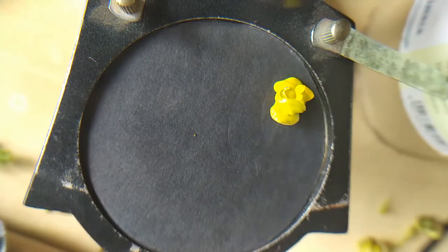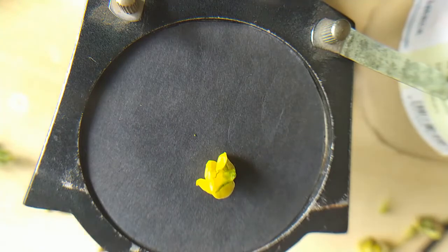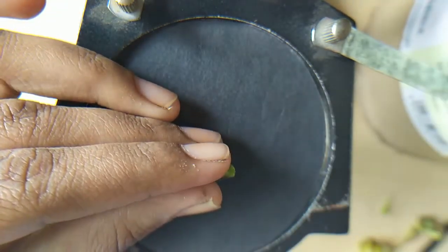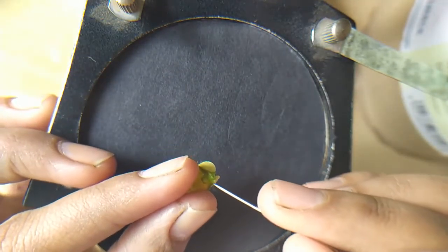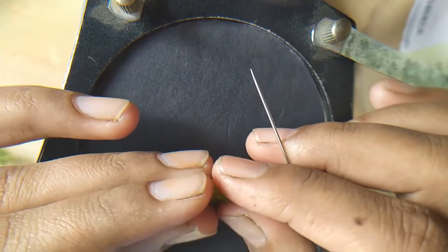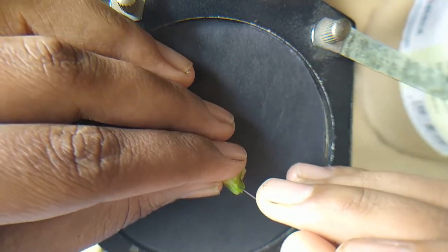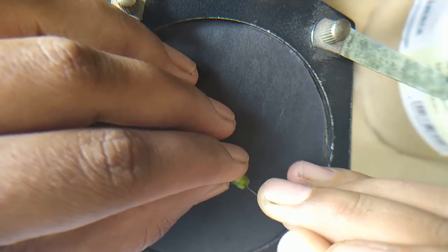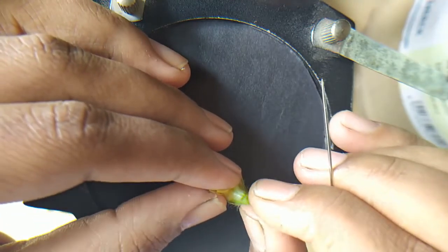So now we start the dissection of urad bean. Firstly, you have to remove the calyx. Okay, the flower is somewhat tough, so give a gentle cut to the calyx.